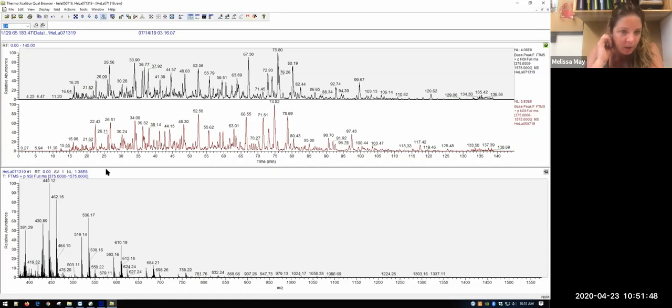And so I can see that the chromatograms look similar, but they're not quite the same, right? So we have some differences right here. By doing this, you can look at, let's assume this is the same peak, right? Over the course of about 2 months, we had a drift of less than 20, no, less than that, 10 seconds, so 0.2 minutes in retention time as things are coming off the column, okay?